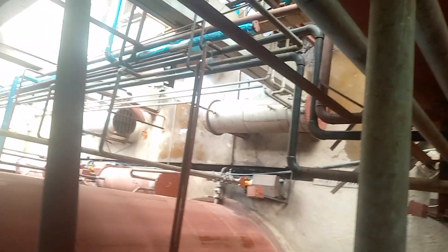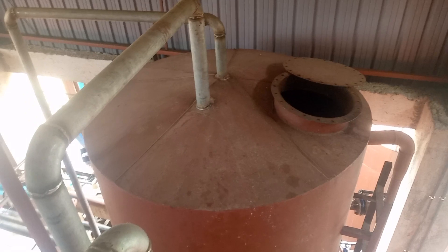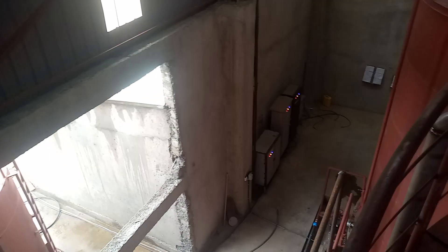Over there we have our cooling system — you can see the heat exchangers, how my team designed them. Those are tubular heat exchangers, which are normally used. Once we have that, we have the clarification section, then after clarification we send the material to the distillation section.